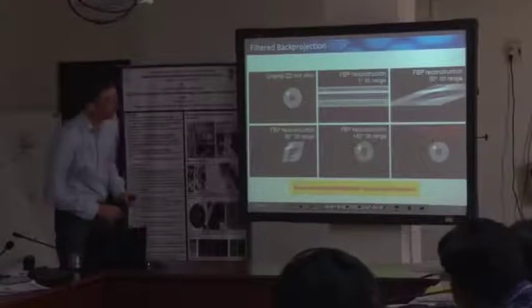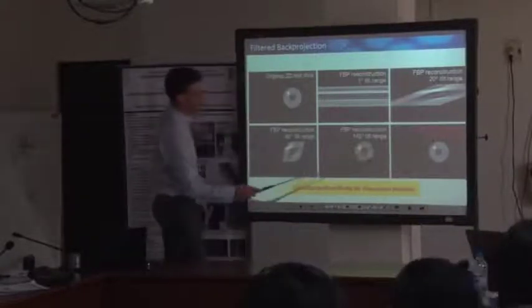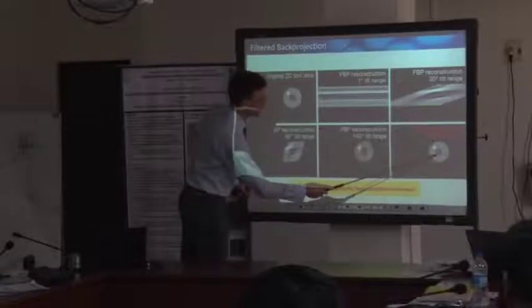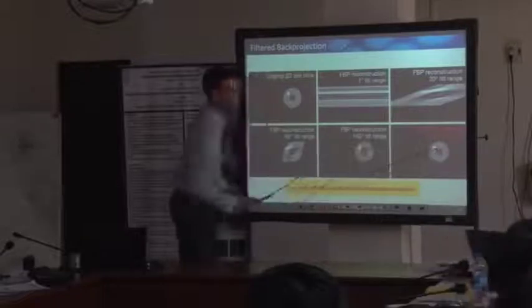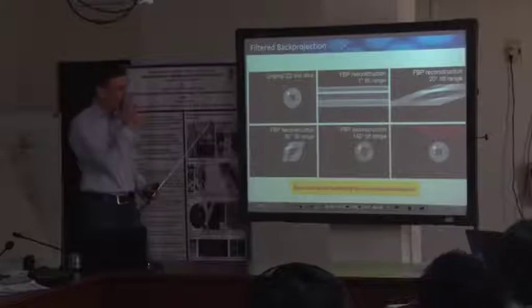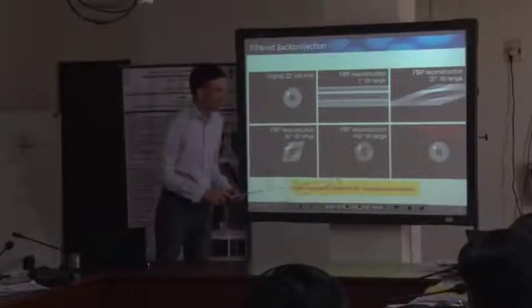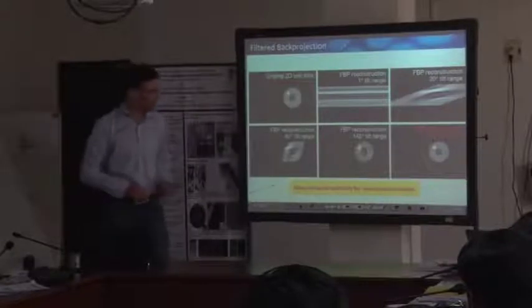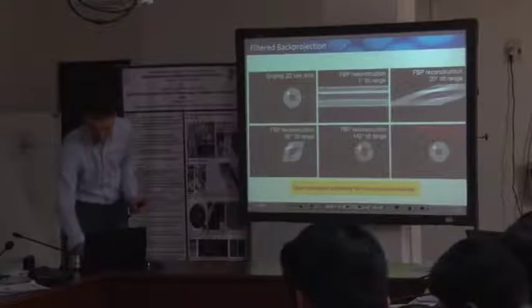You might apply even filtering. And the quality of this back projection, this is what you might get out of that. So the quality here of the filtered back projection is even better than the simple Radon transformation that I showed in the very early beginning, if you compare that. And it works far better for incomplete data sets than the simple back projection.